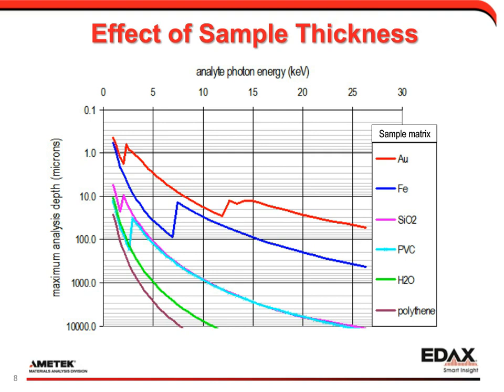As we start to fill in some elements into this graph, for instance, using iron K lines, and then on the higher end cadmium K lines, we can see where those correlate with their respective thicknesses. So if we are, for instance, analyzing an element such as iron in a glass, we have an analysis depth somewhere at maybe a couple hundred microns nominally.